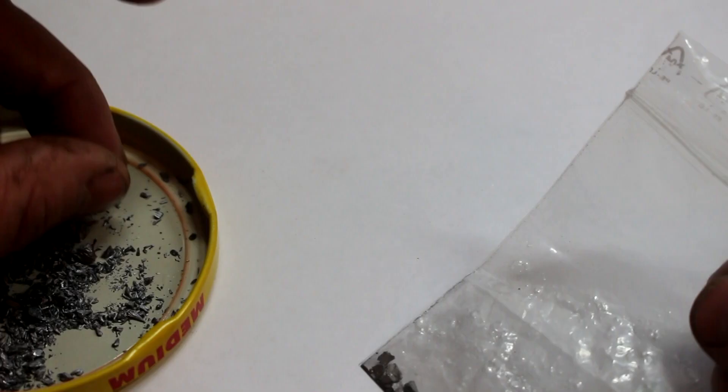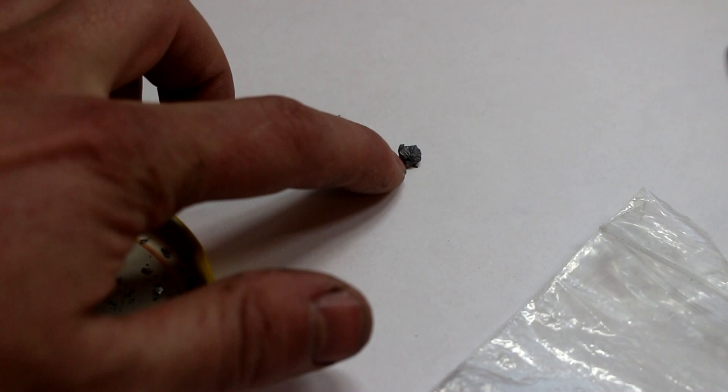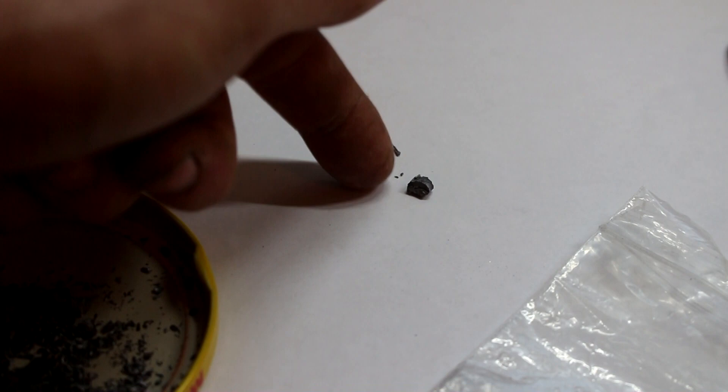I'm going to take a piece out and put it someplace warm — probably on the windowsill — and see if it will ever actually turn back into metallic tin. Obviously it probably should, but what will it actually do and how long will it take? I'm going to find out. Probably not going to be any results in this video, though. It can live on top of this rock next to the potato.